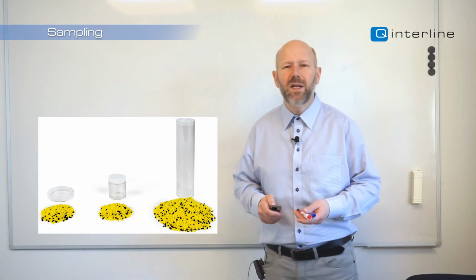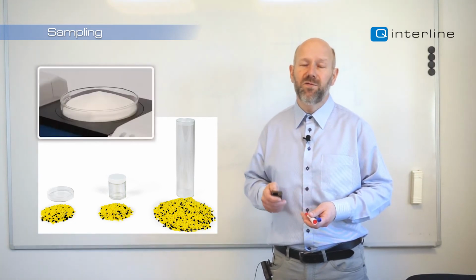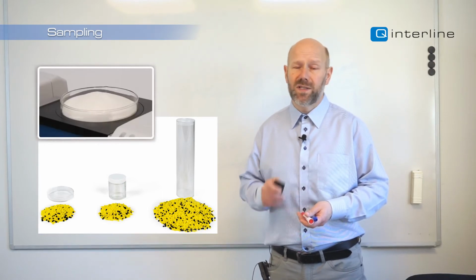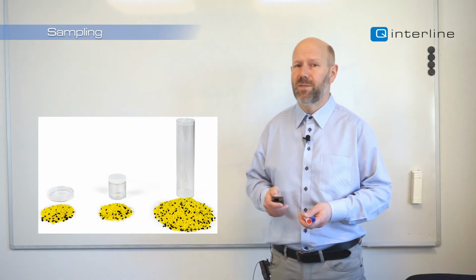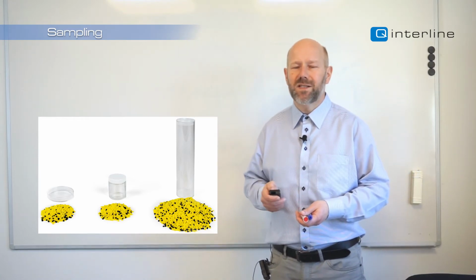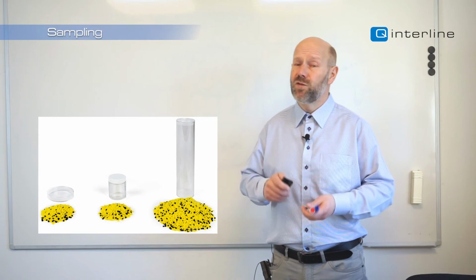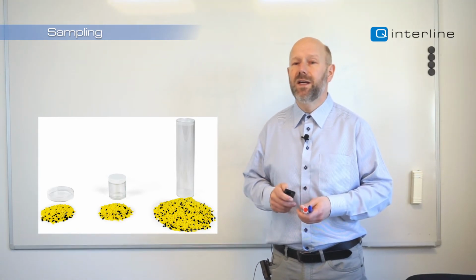Let's look into the sampling of a petri dish. The petri dish is easy to use. Powder can be filled in easily, but we see only what is at the bottom. So we better make sure that what's at the bottom is representative of the entire sample. And we don't see the entire bottom. Most of these accessories see a rim of some 18 square centimeters in area at the side. So the way the pearls, the plastic pellets, fell into the petri dish was very determining.